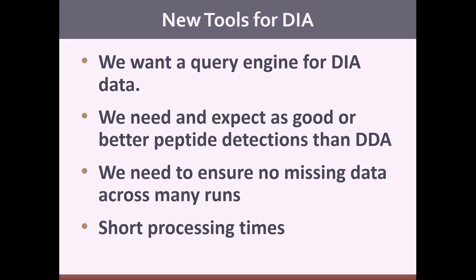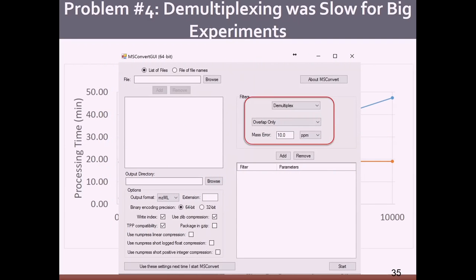While we're doing questions, maybe I can ask about the MSConvert. So this just gives you out a file which has an mzML file that has basic. If you started with 20, now you get essentially simulated 10 m/z windows. So it looks like a regular. That's right. So you can run it into any software. That's correct. Okay. Cool. Yeah, so basically you can output any of the file formats that ProteoWizard supports. And if your windows are overlapping, it will automatically demultiplex those MS/MS windows to the narrow window size.